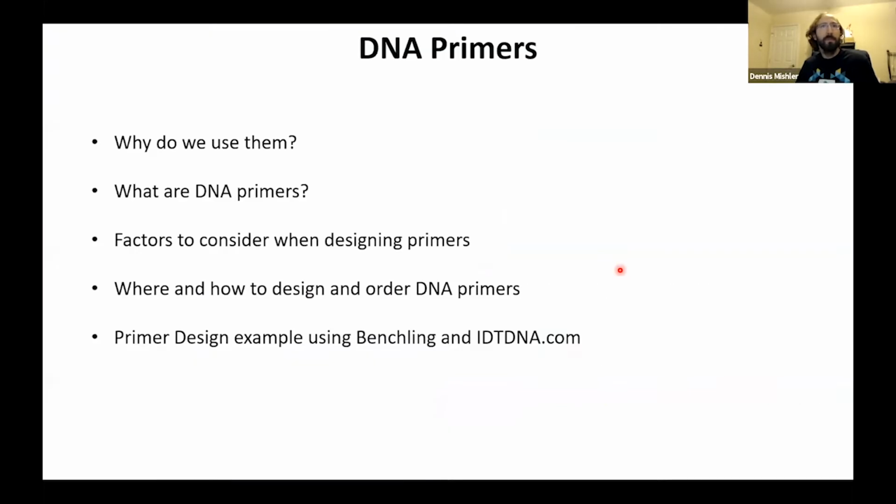So, primers, DNA primers, really important. I'm going to talk to you about why we use them, what they are, what factors to consider when you're designing your primers, and a little bit about how you can go about designing them online on apps and how to order them.